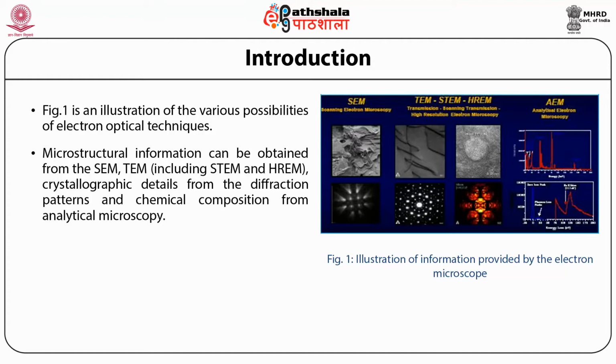In this module, we shall focus our attention on the signals arising from the interaction between the atoms of the specimen and the high energy electrons, their characteristics, information available, and the methods of detecting them. It will be emphasized that more than one signal may be used to obtain a specific information, say chemical composition.